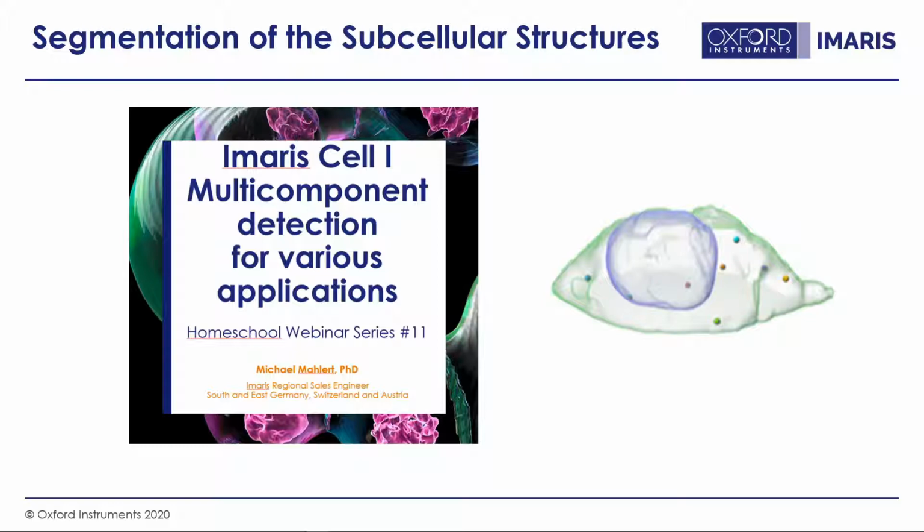The cell means, in the very broad sense, with its whole broad spectrum, that it does not have to be an animal cell or plant cell or alien cell.